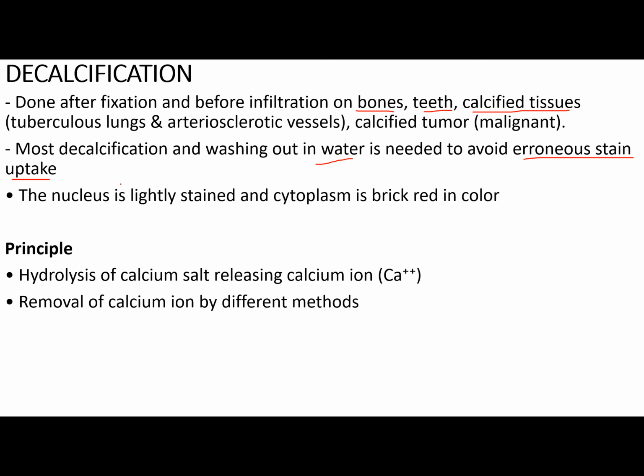Ang mga decalcifying agents nyo kasi, class, they have a tendency to uptake stains. So that could affect the staining procedure. So kailangan nyo talaga siyang ma-wash out properly. Then the nucleus is slightly stained and cytoplasm would appear brick red in color.